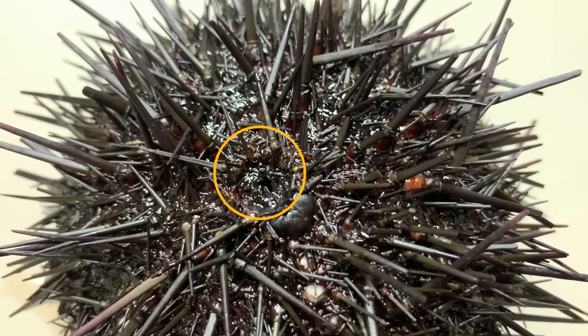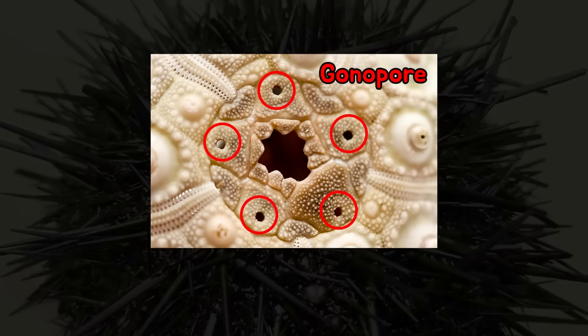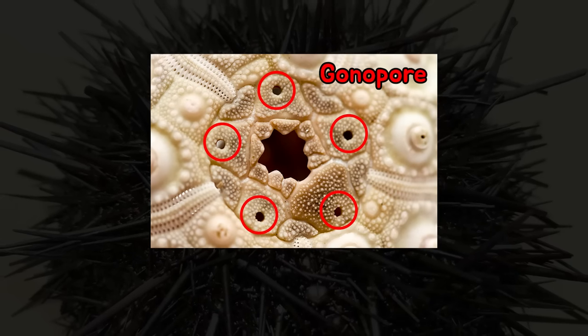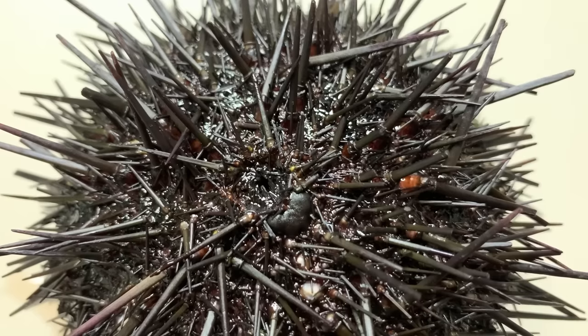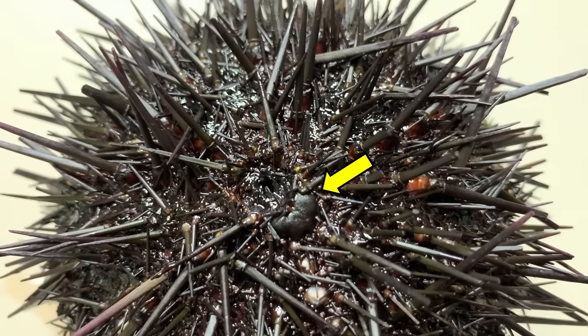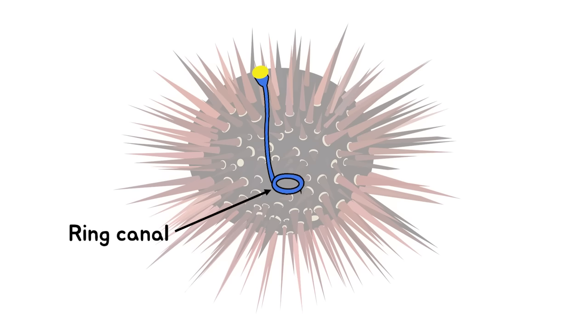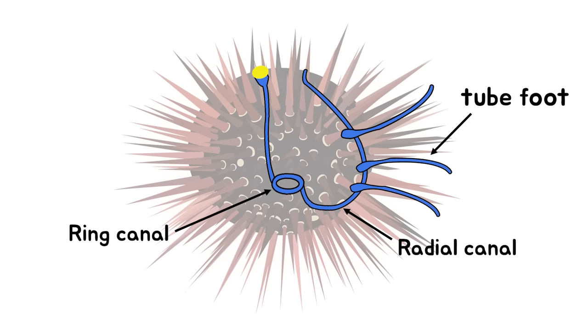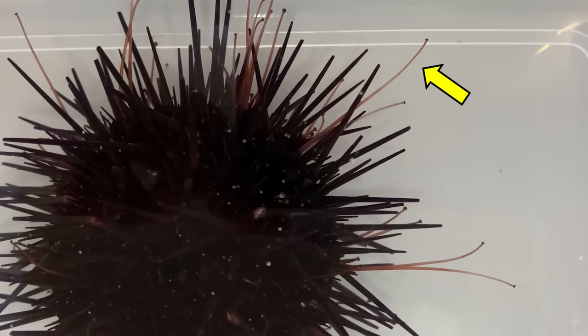The anus is at the top of the body, and they have many other holes around it. There are 5 gonopores, which are the holes where they release sperm and eggs, and there is also a hole called a madreporite. Sea water enters the sea urchin through this madreporite, and the water passes through the ring canal and the radial canal inside the sea urchin, and continues to flow to reach the tube feet. So the inside of the tube feet is full of sea water.